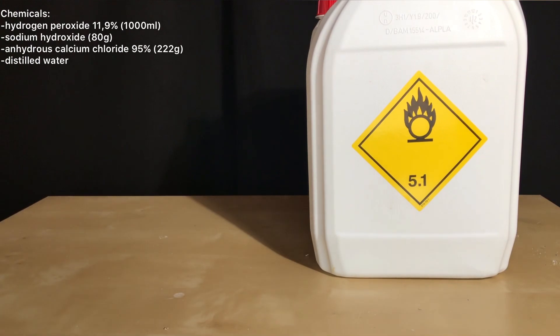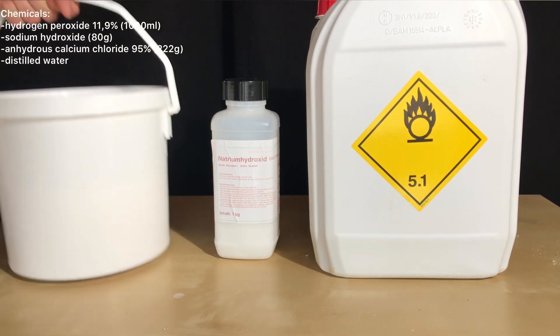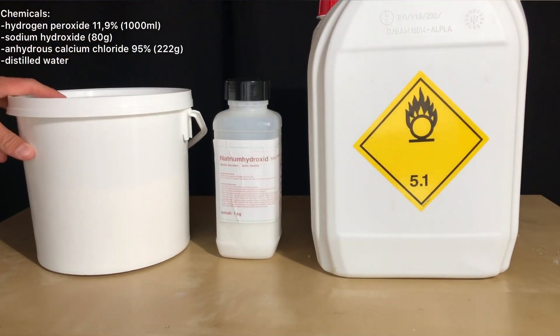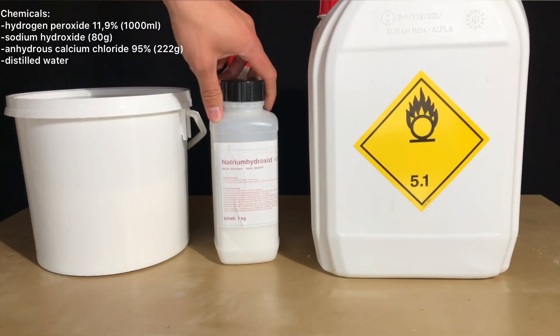For this, we are going to use 1 liter of 11.9% hydrogen peroxide, which is a huge overkill, 80 grams of sodium hydroxide, 222 grams of 95% anhydrous calcium chloride and, of course, distilled water.